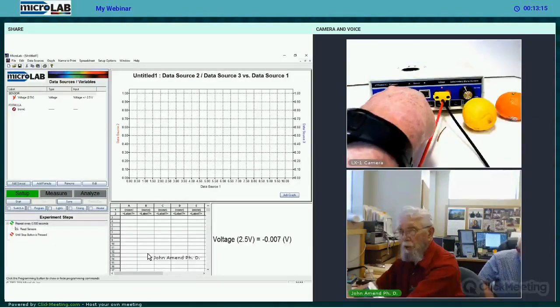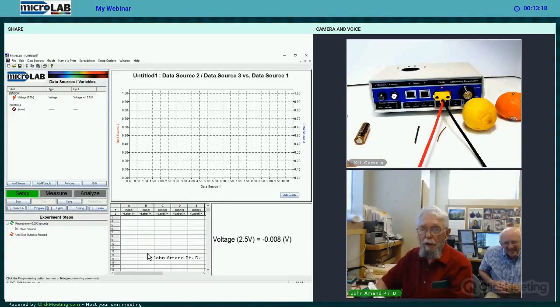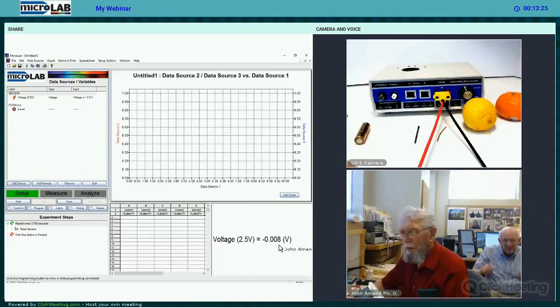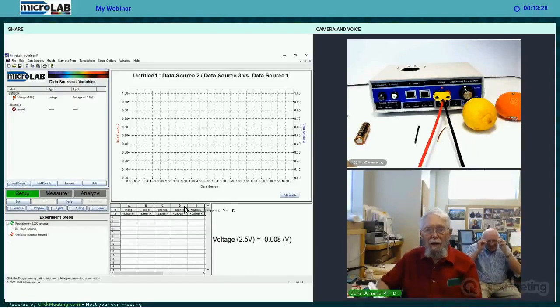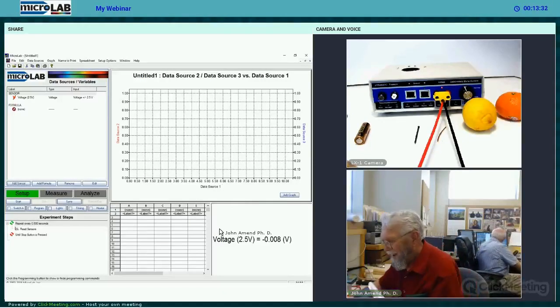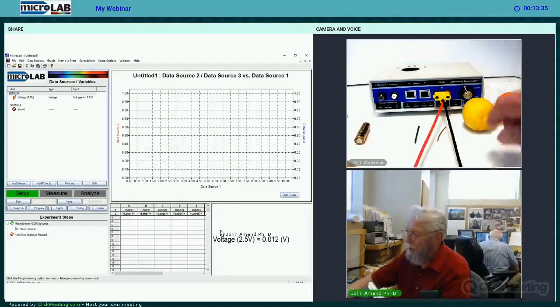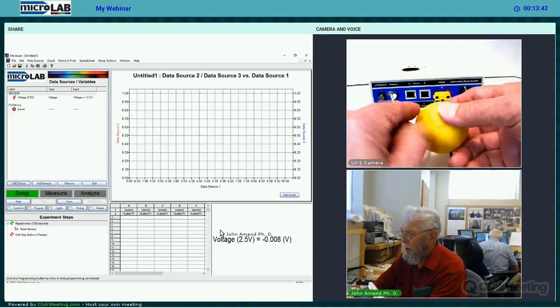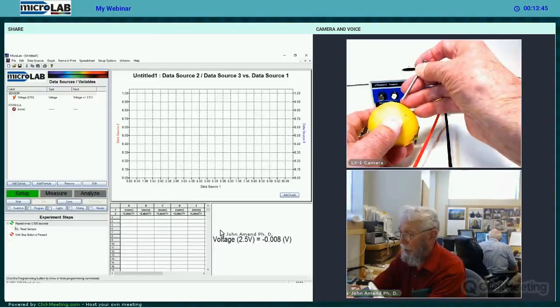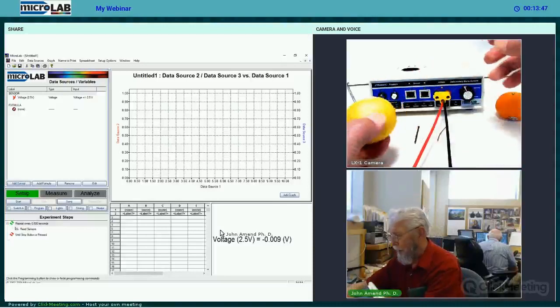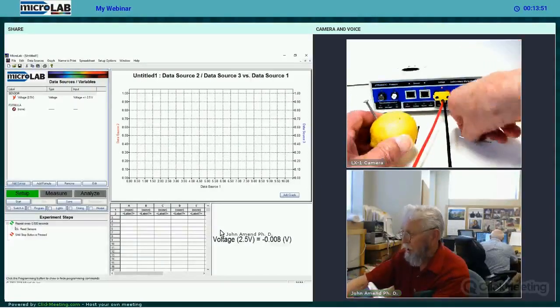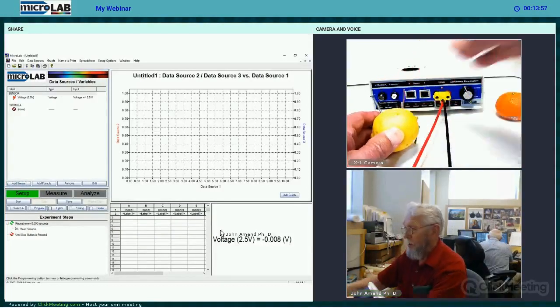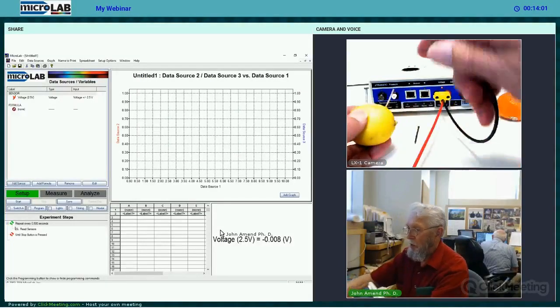Now, we wanted to examine some other electrochemical cells. And in a bit of fancy, we decided we'll use that. Anyway, in a bit of fancy in this thing, we decided that we would make a cell from that lemon. And so we have it. And we'll carefully insert a zinc-coated nail. Carefully. And in the other case, we need another electrode, of course. So we'll insert a copper electrode. Carefully. And we should be ready to make a measurement.